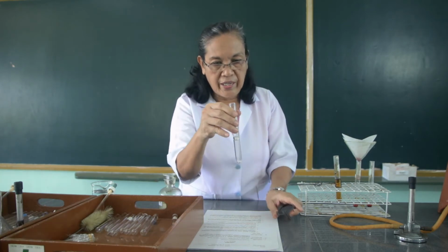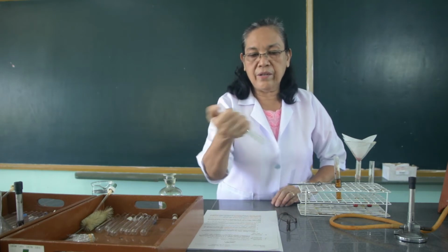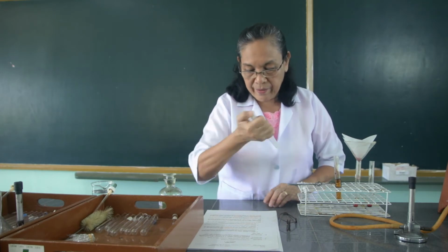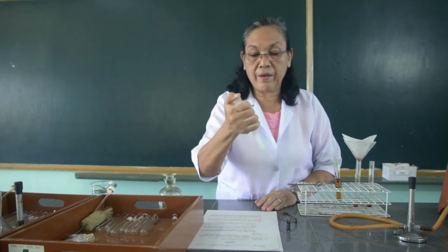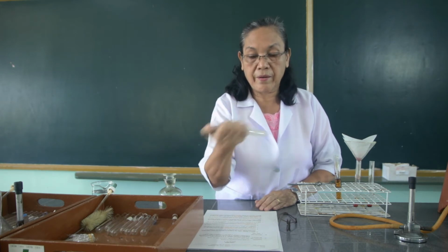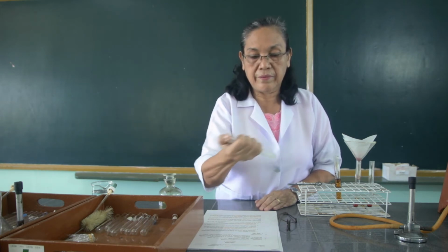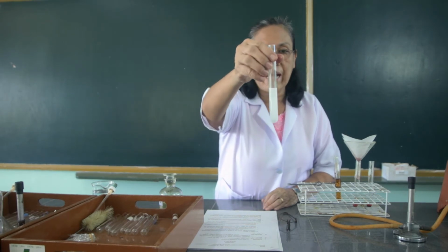Then we will shake this vigorously. So by vigorous shaking, you do it this way. Then after shaking vigorously, I would like you to observe what happens.